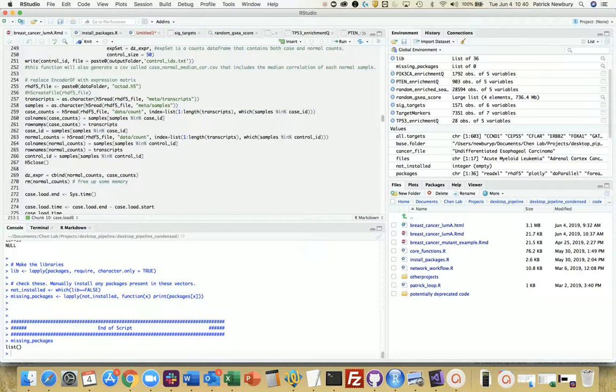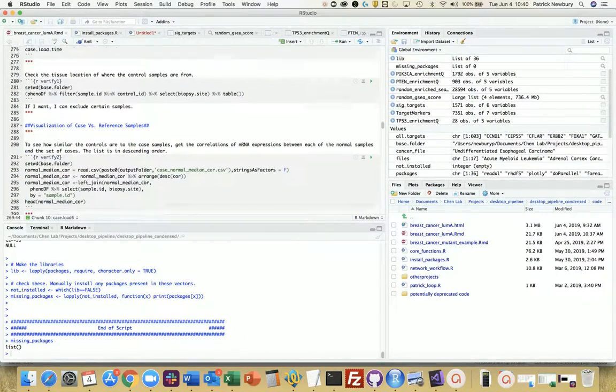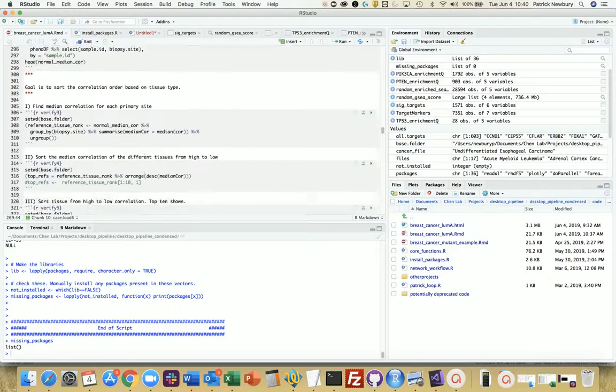To conduct differential expression analysis, or DEA, this DZ-EXPR needs to be replaced by counts if you did use encoder DF. Using the provided data, these lines accomplish that. The next few chunks are validation of where controls were selected from.